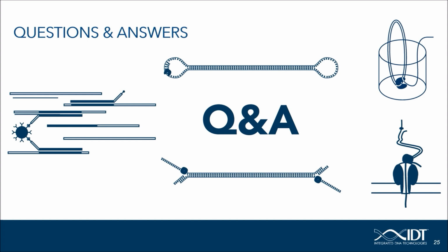I have a few questions, and I think we're going to start with you, Tim. Did you require any additional capture probe optimization for your target loci, or did you just use a standard panel?